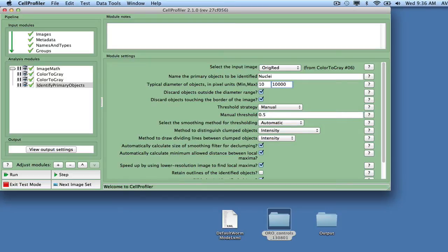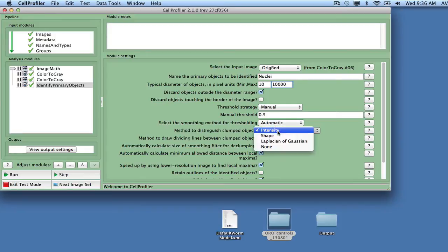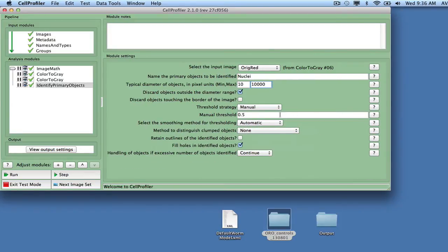Make sure not to discard objects touching the border of the image, as we do not want to lose clusters of worms where only one or a few worms are partly outside the field of view. In this case, we will not attempt to separate touching objects, and we will call the output Well and Bubbles.